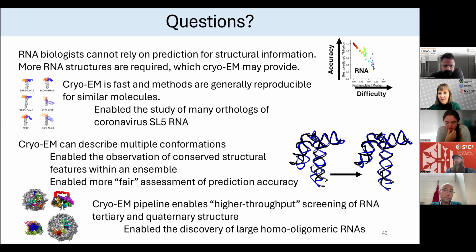So, potential ways to mitigate the aggregation. One is potentially you're folding at too high of an RNA concentration, depending on how you're folding, obviously. For us, if we fold at too high of an RNA concentration, there are just too many RNA molecules in the same tube. They interact with each other and start to aggregate, right? So how you can avoid that is fold it at a lower RNA concentration, concentrate it down, and then freeze it. The other possibility, I think I mentioned this before, is that magnesium concentration also affects aggregation.